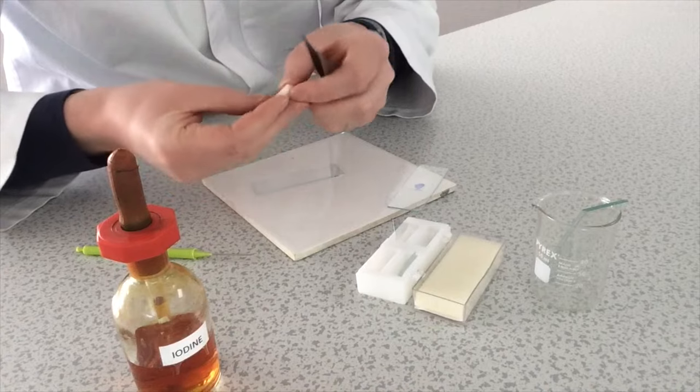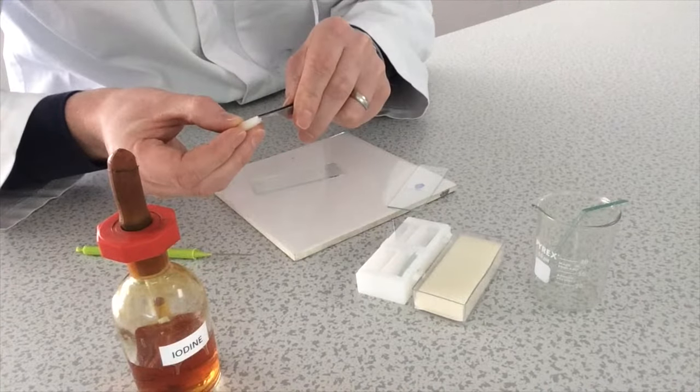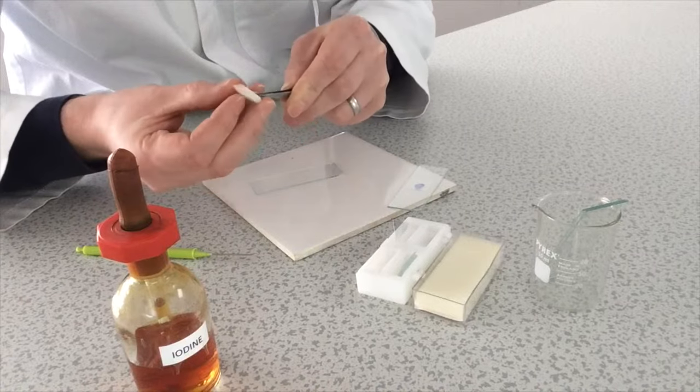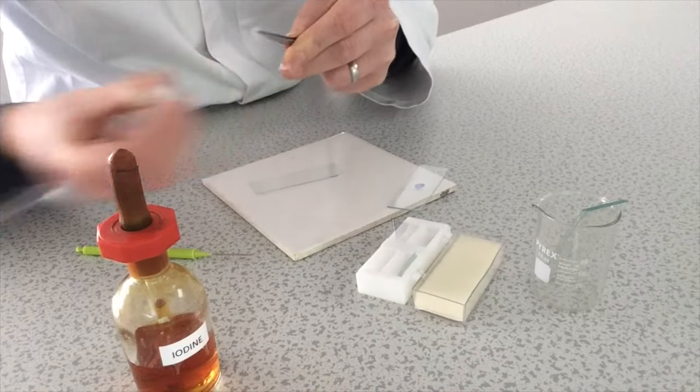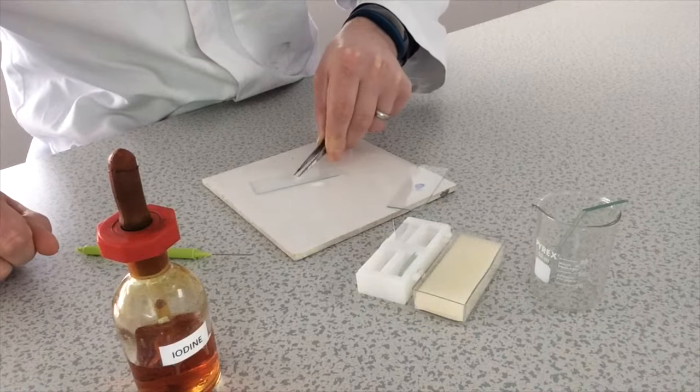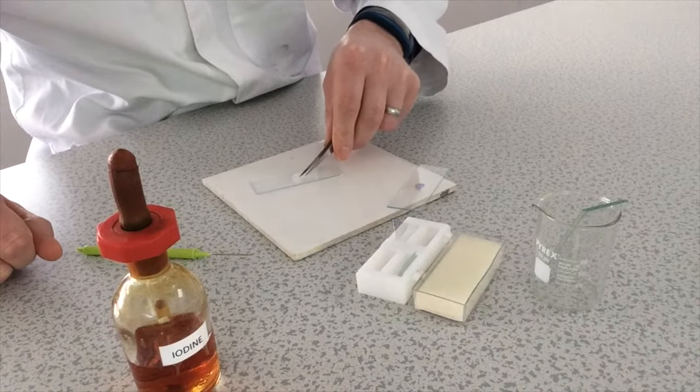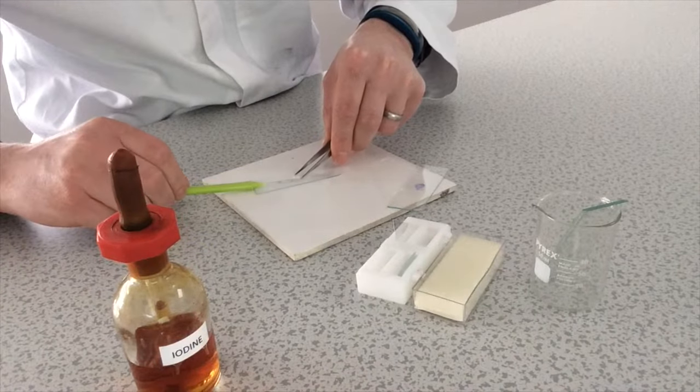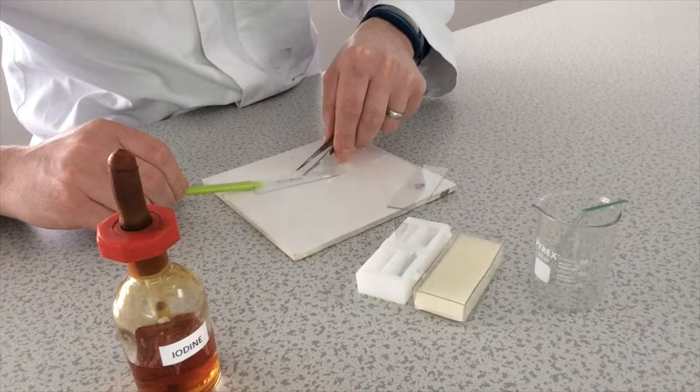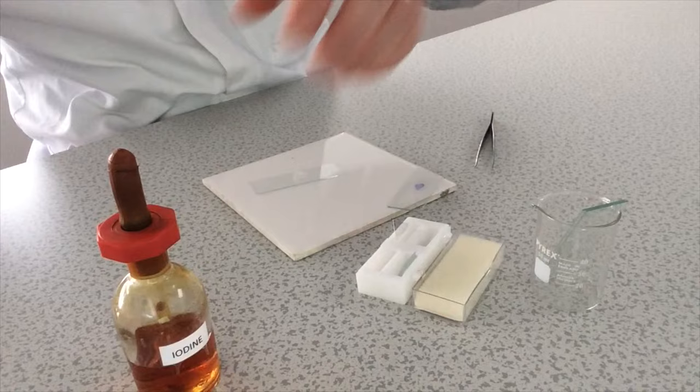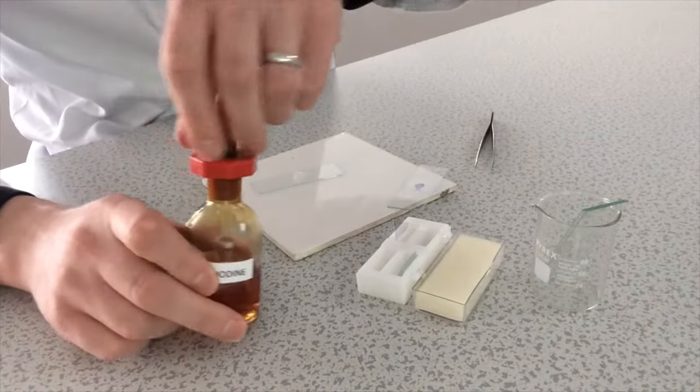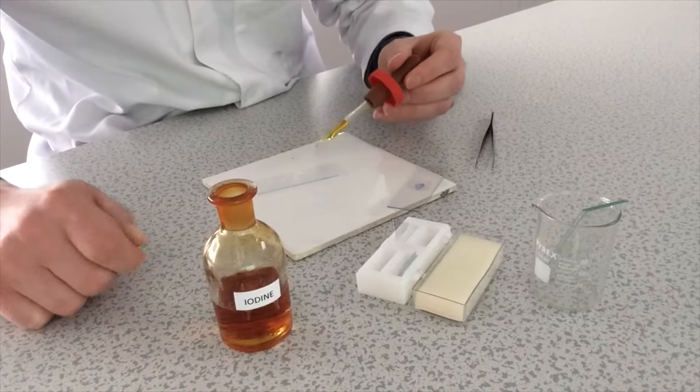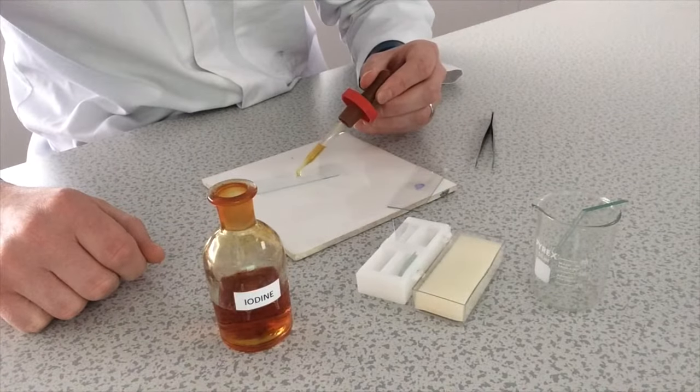Just find the epidermis. There we are. Just lay that onto the slide. It's quite a big piece I have here so it's curling up a bit. And that should be perfect. Now I need to add a drop of iodine to the onion epidermis on the glass slide.